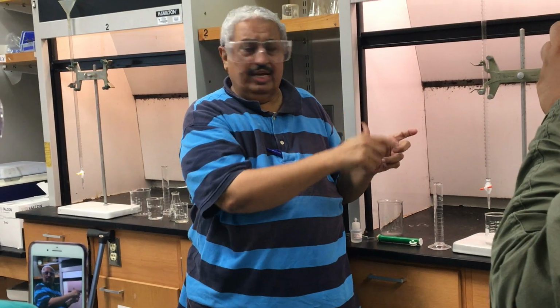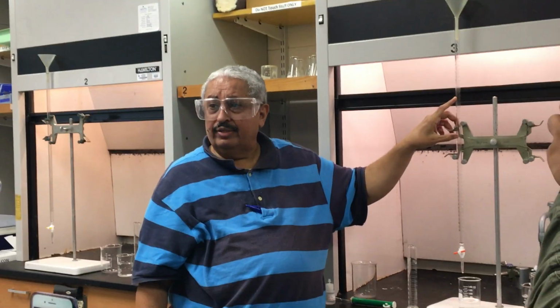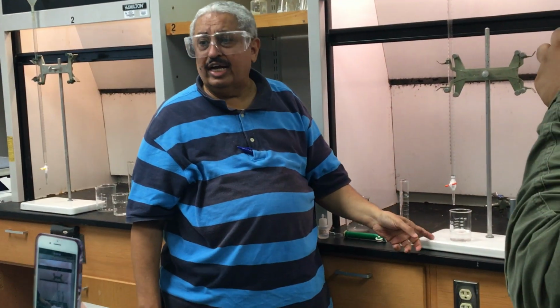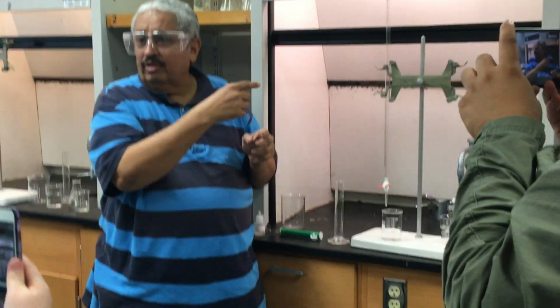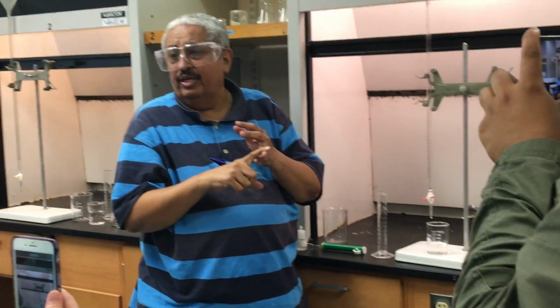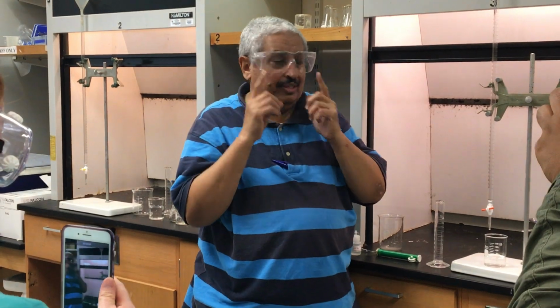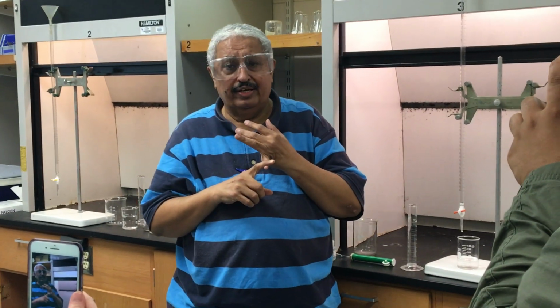I can reverse this. I can put the acid here, acetic acid, with known molarity, and sodium hydroxide with unknown molarity, correct? I can switch their positions. So it is the determination of the unknown concentration of an acid or a base. Whatever you like the unknown might be, but today the unknown is the acid, acetic acid, found in vinegar.